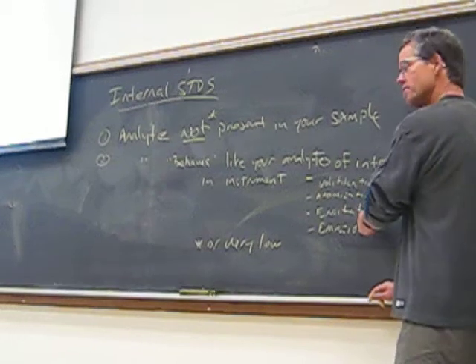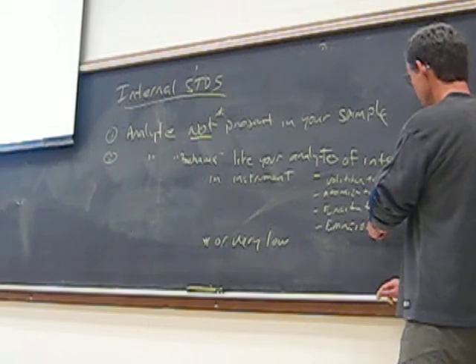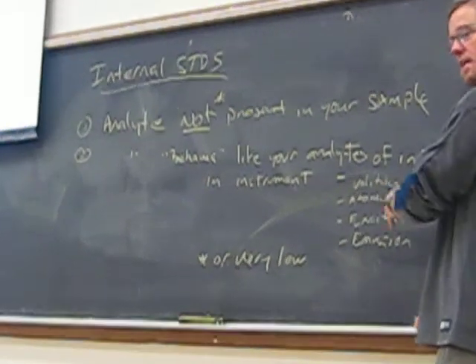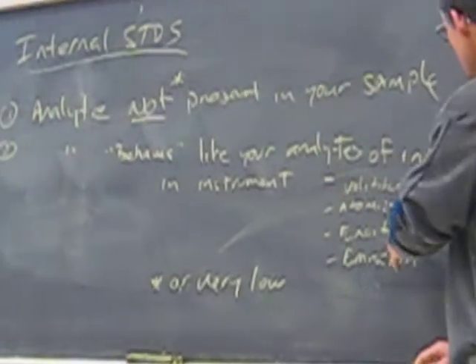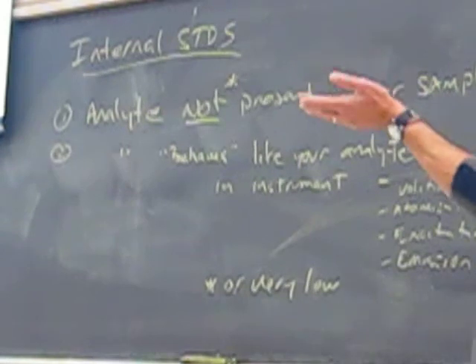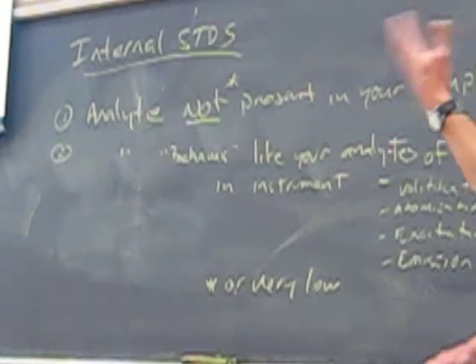Either get excited for OES or ionized for mass spectrometry. And it generates an emission spectra, but you want the internal standard analyte you add to do things similarly to what your analyte does. And in fact, that's the assumption. The assumption is that it does. It behaves similarly.